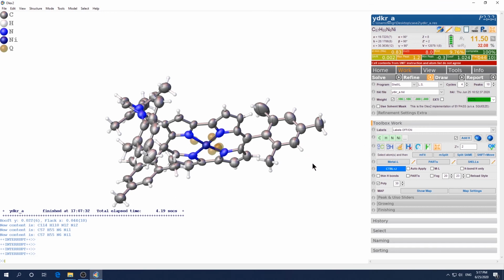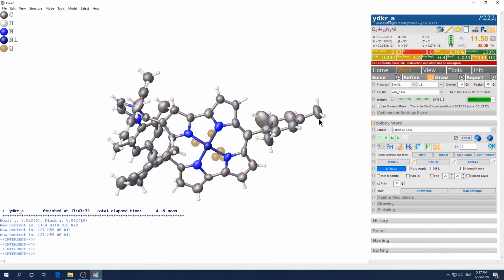If your structure is indeed chiral and you are interested to find that chirality by the X-ray method, you need to switch to copper, try to get a higher redundancy and scan a high angle. That will give you a more reliable Flack parameter. More reliable means the ESD in the parentheses is very small. Okay. The next scenario is the Flack parameter is 0.2 with a small ESD.